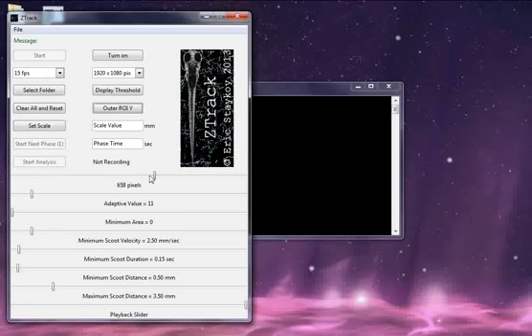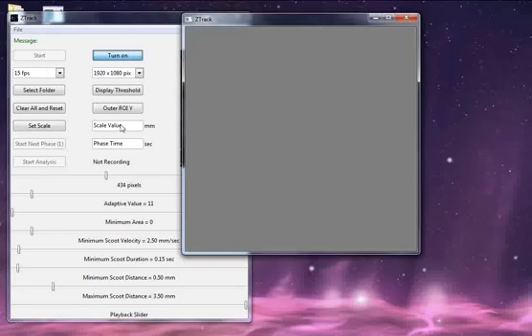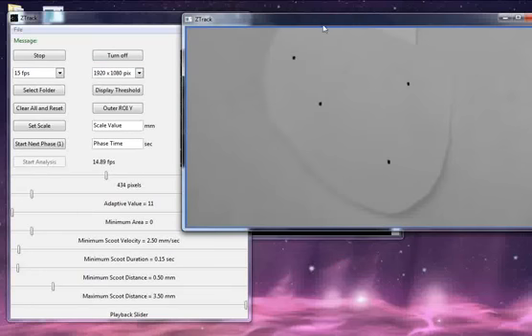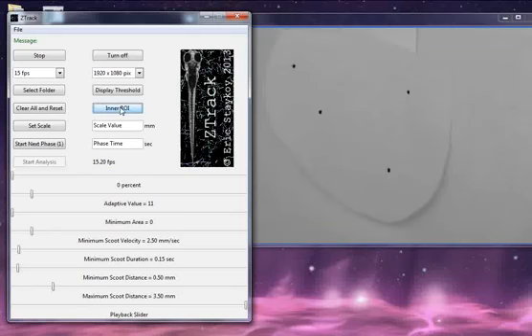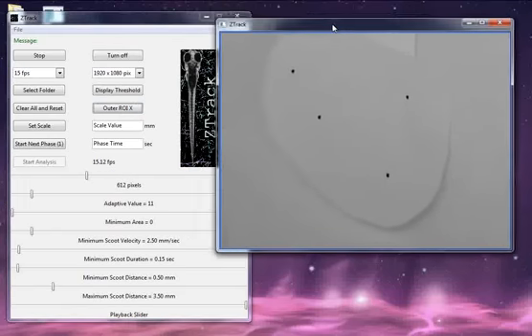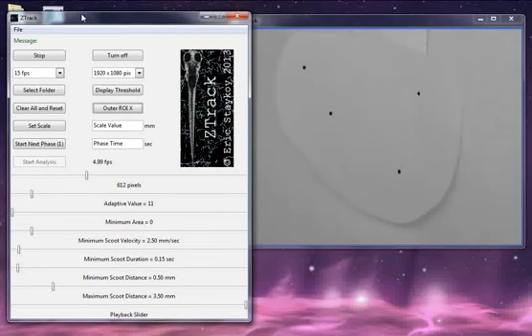What I'm doing now is adjusting the region of interest that you'll be able to see. You can change the resolution to anything that you want it to be, as you're seeing here. The thing that I'm recording is a piece of paper with 4 dots because I don't have any zebrafish at home.